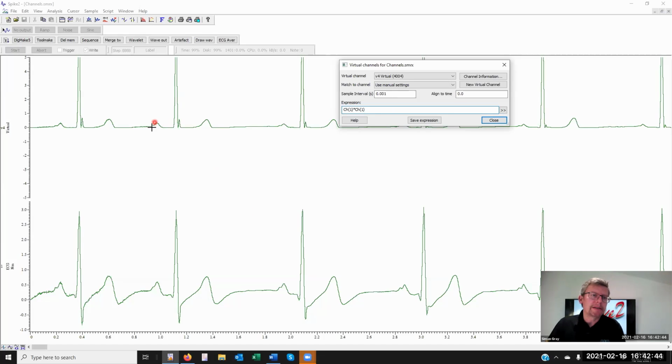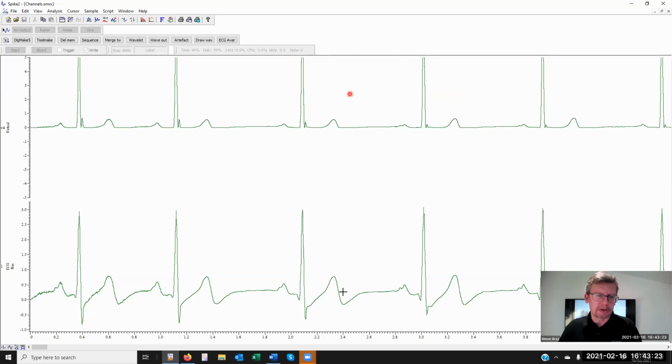Okay. So in some cases, just squaring the data allows us to flatten out areas and make it easier to find other features. Now, used in combination with the original, of course, active cursors may not then trip over small, what might be called noisy events on the original, with a virtual channel squared and perhaps filtered a little. So we're using the virtual channel as an aid to the cursor search functions. So that's a moment to move on to the cursors.